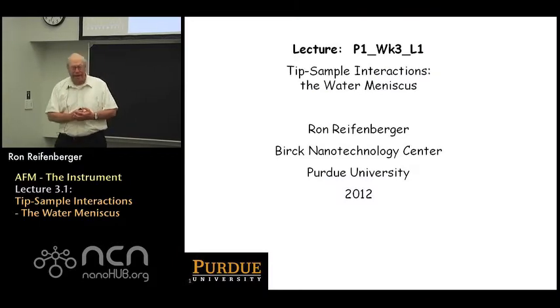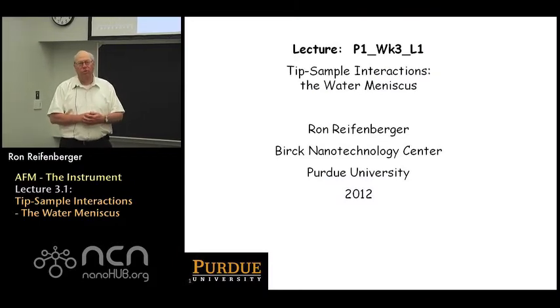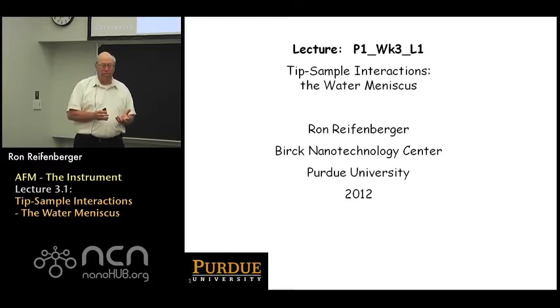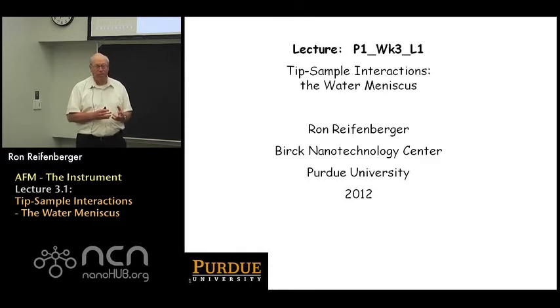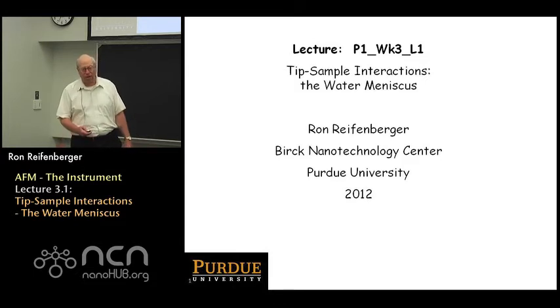Hi, and welcome back. This is the start of the third week of the course called Fundamentals of Atomic Force Microscopy. And in this week of the class, we're going to start to discuss in detail some of the experimental aspects of atomic force microscopy. But before we begin that discussion, we want to finish up with these tip sample interactions, and in particular, we want to discuss the water meniscus that forms between the tip and the substrate, and we want to discuss what new effects this meniscus will bring about in the practice of atomic force microscopy.